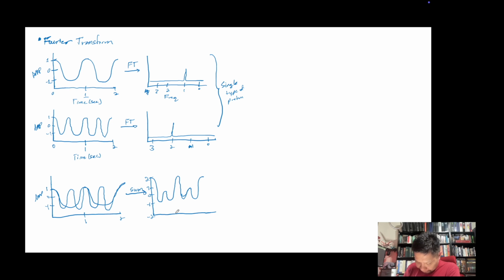And so, I forgot to draw the x-axis, so that's 1 second. And then that's 2 seconds right there, right? And so this is the sum of the different frequencies. Right? The sum of the different frequencies. So after the computer does the sum of the different frequencies, we do a Fourier transform. And it's able to deconvolute this sum, right? Because you by yourself wouldn't be able to do it. You would just see a whole bunch of overlapping lines, right? Because there's so many different types of protons on a particular molecule sometimes that all these lines just overlap with each other. You can't tell the difference. What the Fourier transform can do is deconvolute this sum of the different frequencies into something that's usable. So here we have our frequency domain again, instead of time domain.